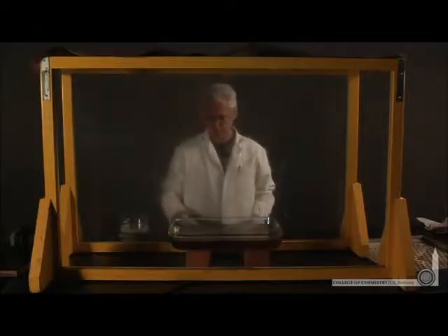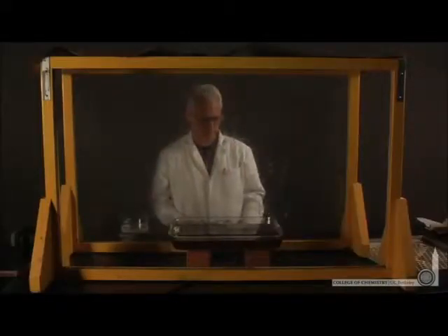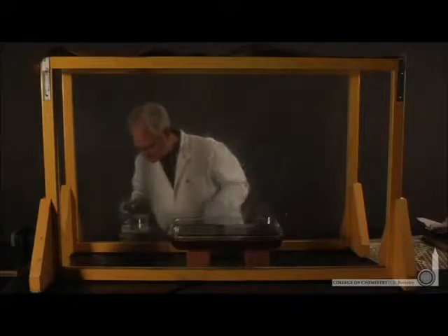Now we can also look at other metals. Sodium metal, for instance, one step down the periodic table from lithium, has a lower ionization energy. So less energy will be absorbed in this case, but the reduction of hydrogen on water to form hydrogen gas releases the same amount. So absorbing less, but releasing about the same amount means overall more energy is released. And indeed you see a slightly more vigorous reaction for sodium metal with water.